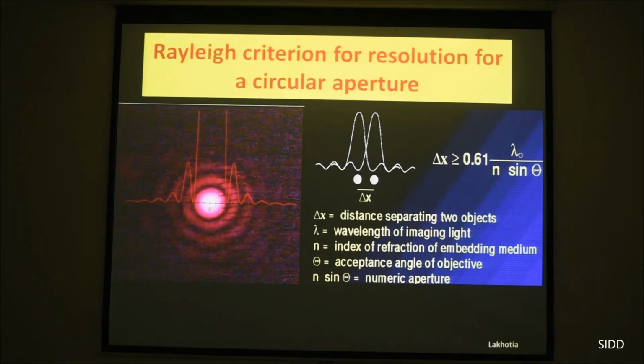And that's where Abbe's formula for calculating the limit of resolution comes in: lambda times 0.61, which is a constant, divided by n sin alpha. N is the refractive index of the medium through which light is passing. It can be air, water, glycerol, oil, or glass accordingly, and it is multiplied by sin alpha. Sin alpha is related to the angle of the light cone which is going through the object, and I'll explain how it's done.